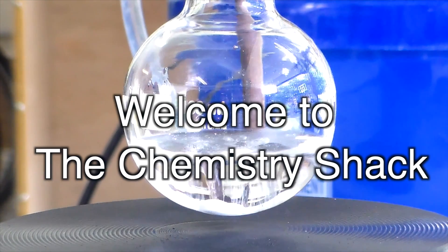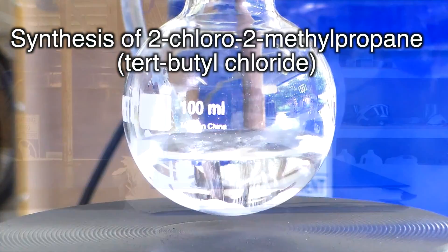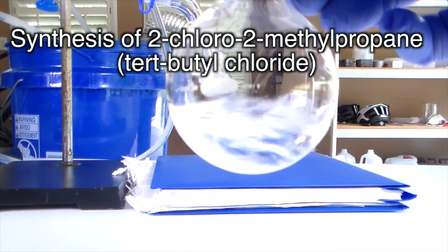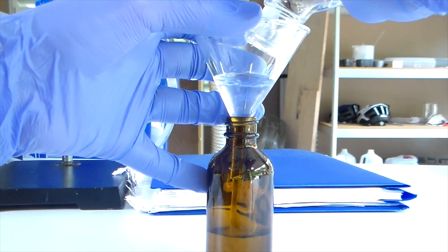Hey guys, and welcome to the Chemistry Shack. In this video, we will be making 2-chloro-2-methylpropane, also known as tertiary butyl chloride, from tertiary butyl alcohol and hydrochloric acid.